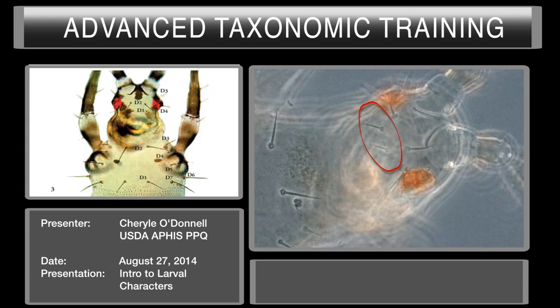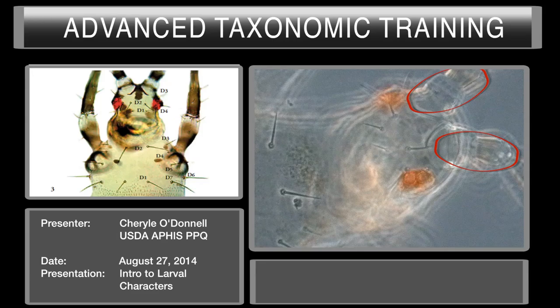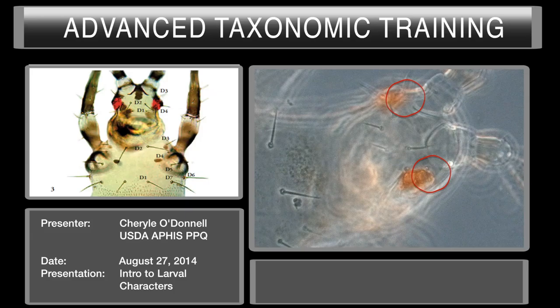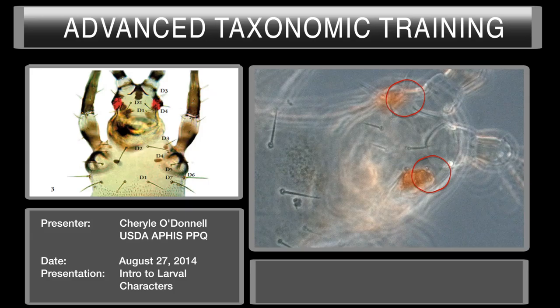D1 is shown right here — this is a pair of setae at the posterior edge of the head. We have D2 setae, which are shown here laterally. The antennae are here, and the eyes. So we are looking at a lateral view. D1, D2. And then we have D3, which is shown right here — just on the anterior edge of the eye. And D4 is back here. D3 is on both sides of the head, and D4 is on both sides of the head.